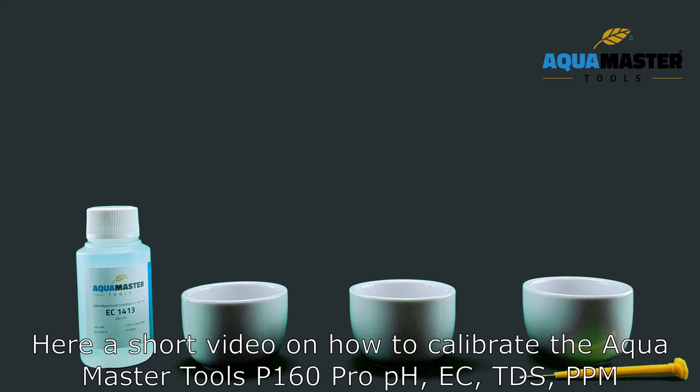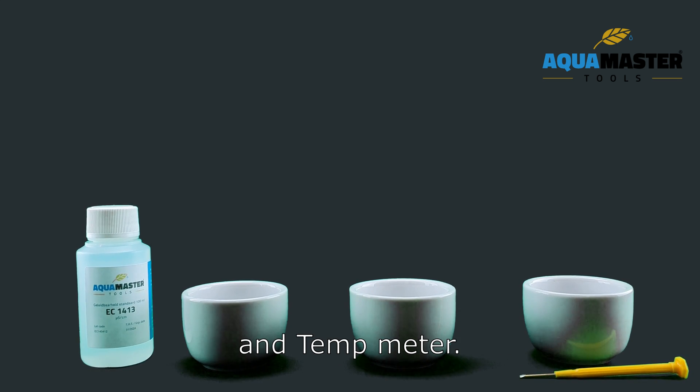Here is a short video on how to calibrate the AquaMaster Tools P160 Pro pH, EC, TDS, PPM and Temp meter.